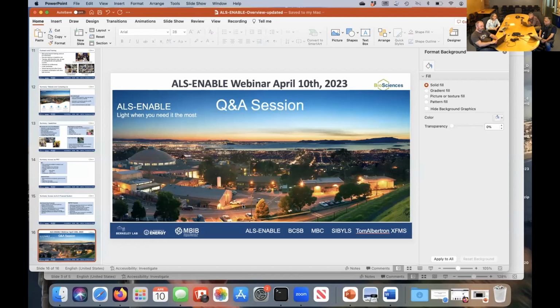Timothy had a follow-up question about the auto processing, asking if people can log into computers and reprocess after their beam time. This is allowed as long as you have the appropriate license for all the software that you're going to use. All the beamlines are using SBGrid to provide all the software available through the SBGrid umbrella, including XDS and DIALS.